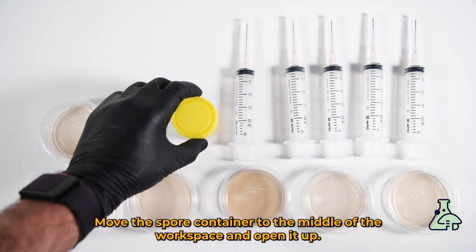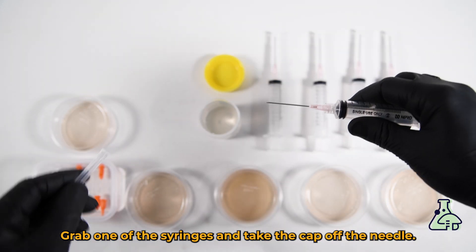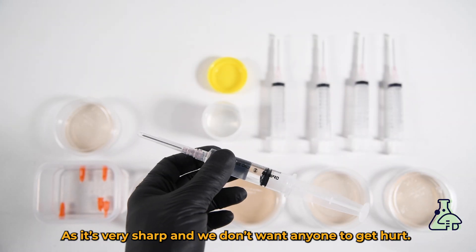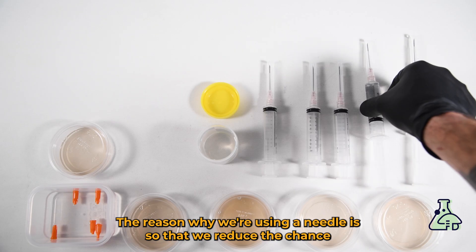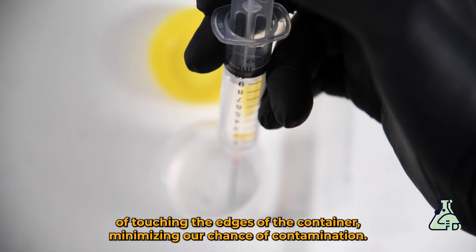Move the spore container to the middle of the workspace and open it up, putting the back of the lid facing down. Grab one of the syringes, take the cap off the needle, and pull the liquid up into the syringe to the 10ml mark. Put the lid back on the needle as it's very sharp. Do the same thing with the other four syringes. The reason we're using a needle is to reduce the chance of touching the edges of the container, minimizing our chance of contamination.